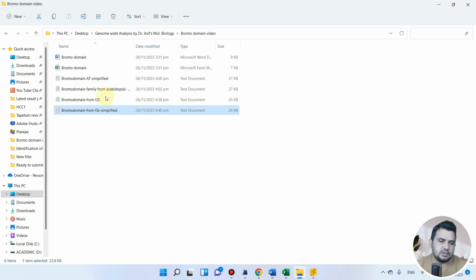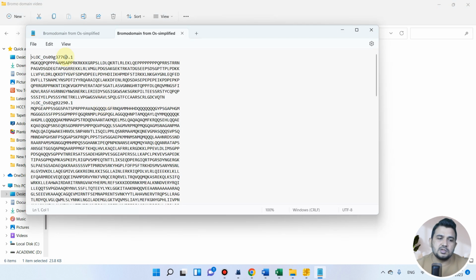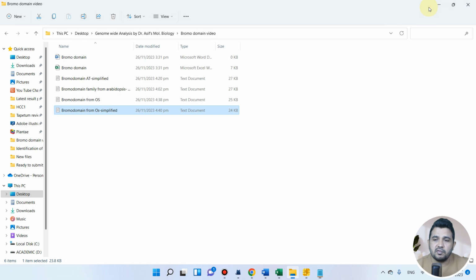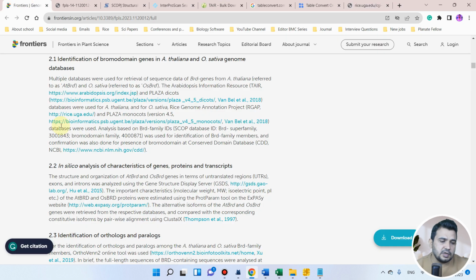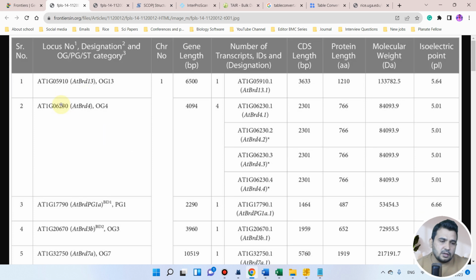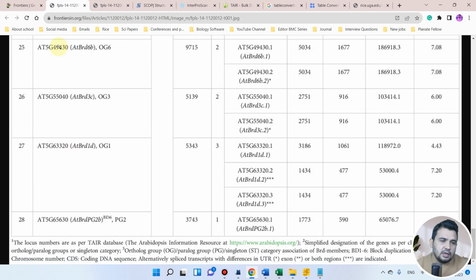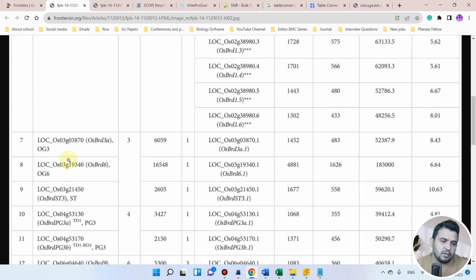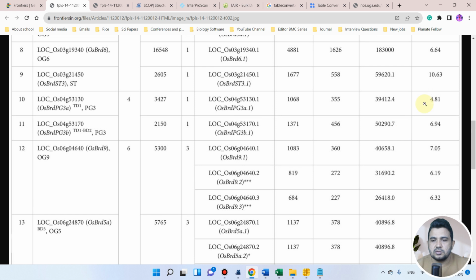So now our two lists are ready that we will be using in our later videos. In the later videos we will be renaming them and using them for our own purposes, like we will use them for phylogenetic analysis. But before that, this should be in the sequence 1 2 3, but that thing we will do in later videos. So far we have generated the list. If you can see in their results, they have the list in table 1. This is the list from Arabidopsis thaliana, and similarly here they have a list from rice or Oryza sativa. So now our lists are ready.